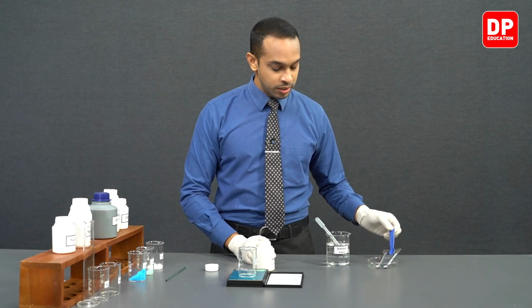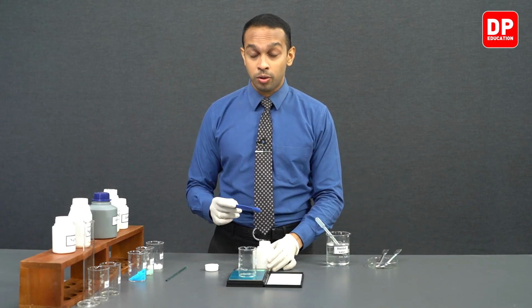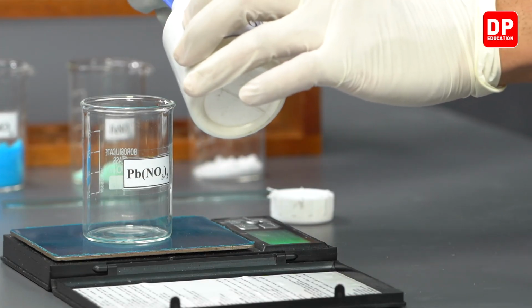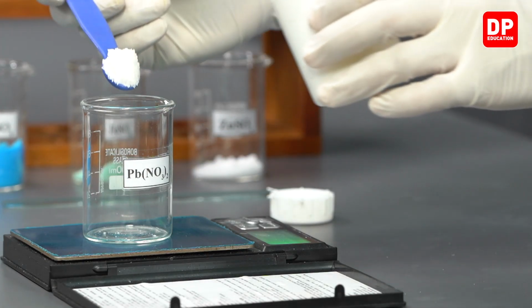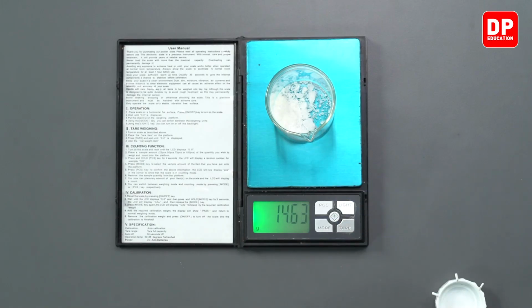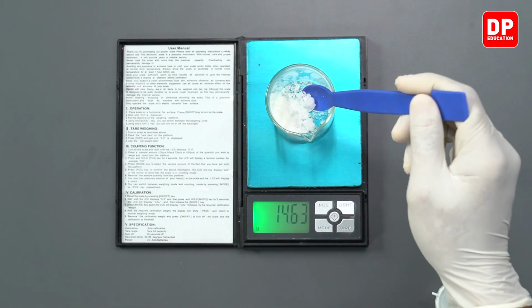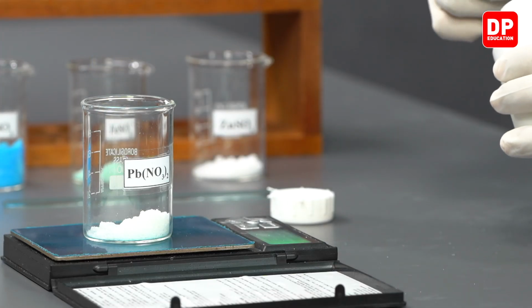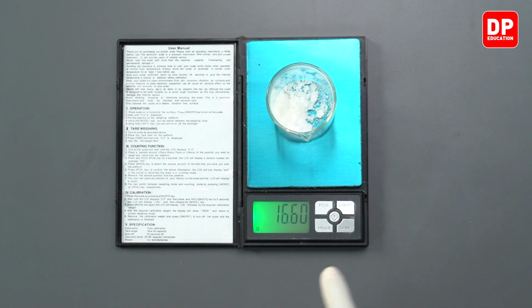So let's measure 16.59 grams of lead nitrate. Now, students, we have measured exactly 16.60 grams of lead nitrate, and you can actually make an interesting observation here.